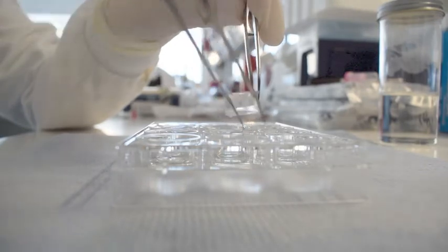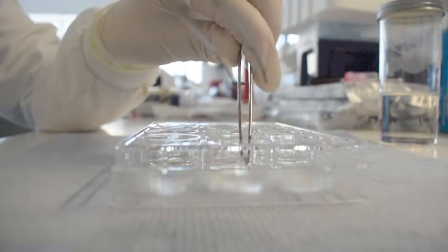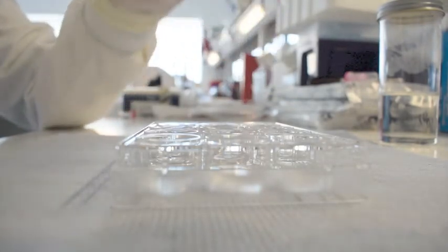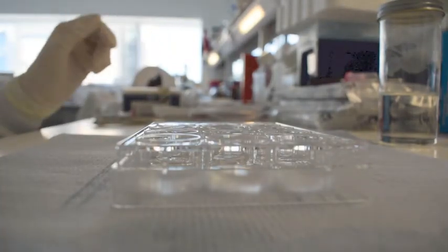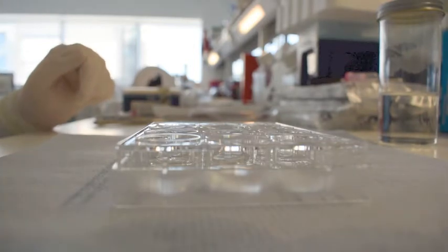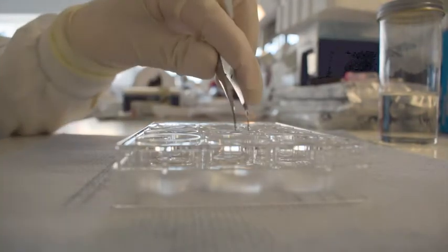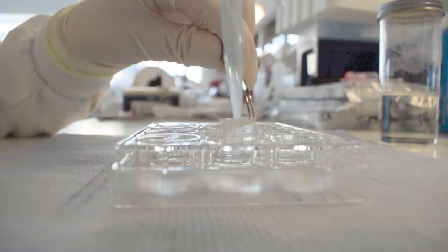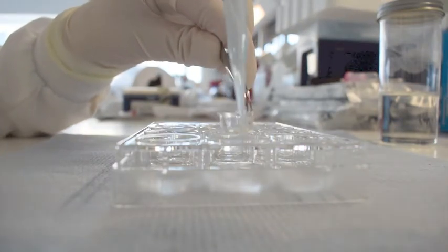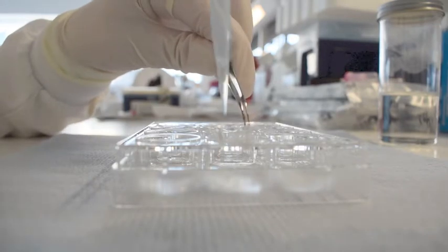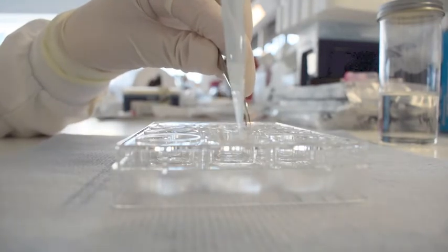This is then placed in a well containing 1 millilitre of trypsin EDTA. Using a pipette, the tissue cup is then washed in trypsin EDTA to remove any cells that remain within the cup.